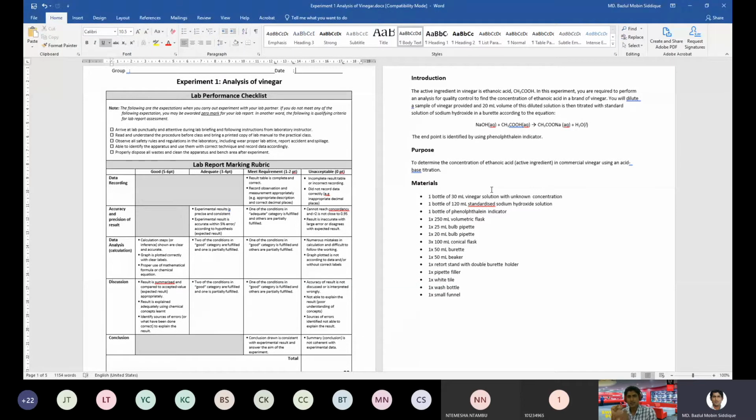Right? So the volume and the concentration. So N equals C times V. So concentration times the volume, if we multiply these two, we will find the number of moles of sodium hydroxide.